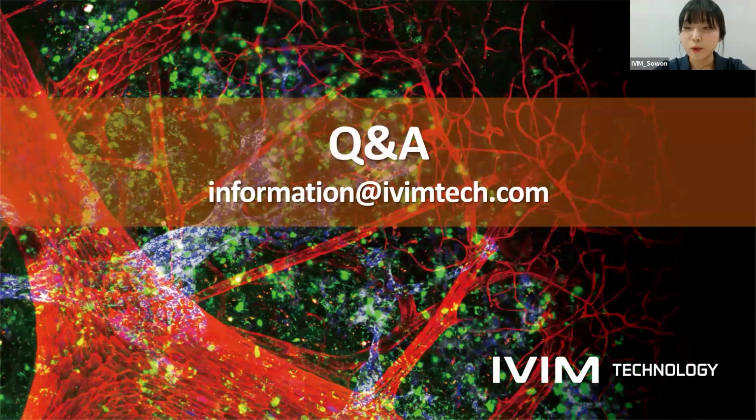Okay, I think it'll be the last question for today's session. So the last one is, once you implant the chamber, how long can it be kept in place? So for the chambers, it can be different according to the organ, but if I give you a brief explanation using our cranial imaging window, the mouse can survive from shortly 6 months to a maximum of a year after having a very good recovery period and after having really inhibited the inflammation that can be caused by the surgery.